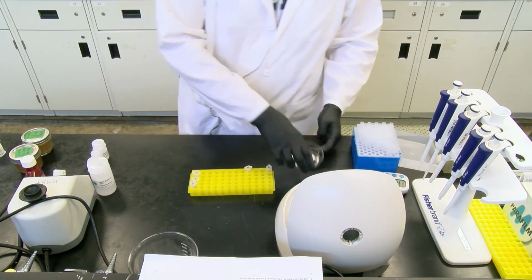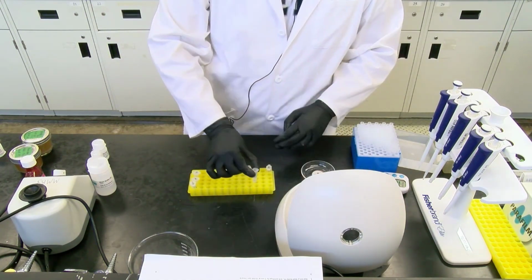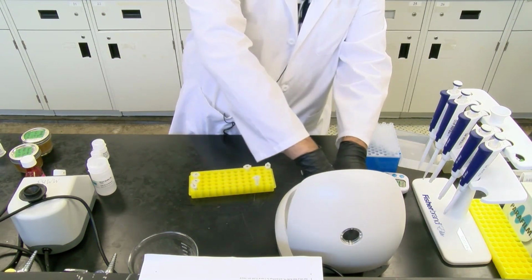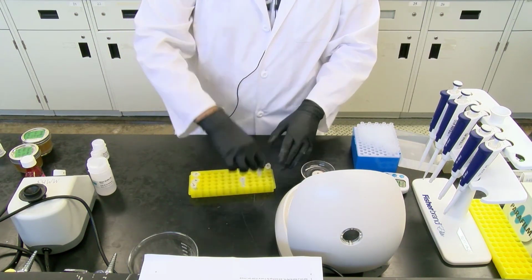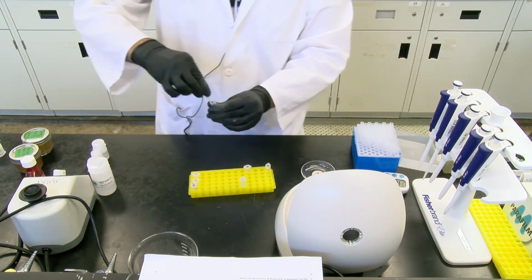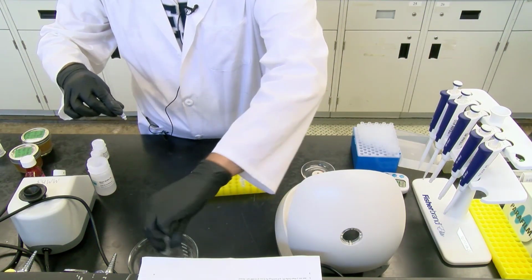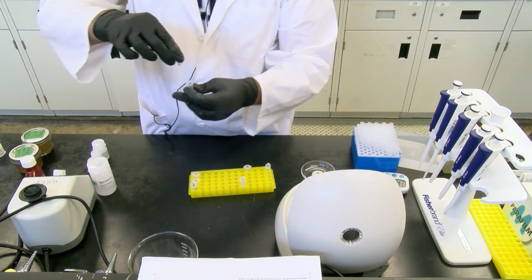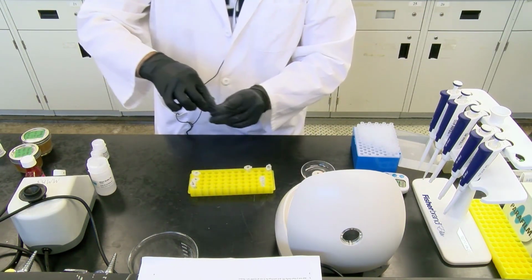Now that they're done, we're going to remove them from columns. And at this stage, we want to be very careful not to splash, because we're trying to make sure all the flow through is at the bottom here. So we're going to discard the flow through.